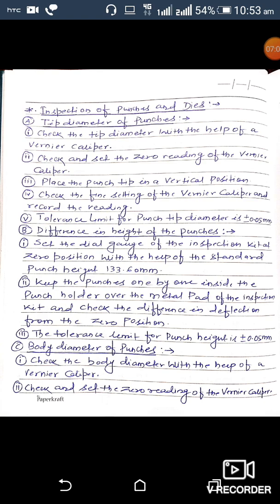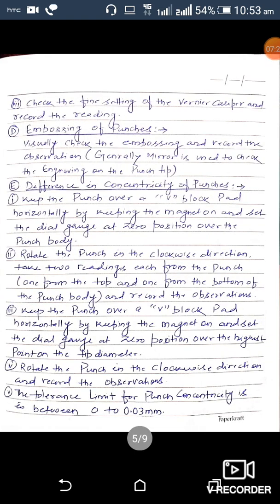Third is inspection of body diameter of the punch: check the body diameter with the help of a vernier caliper, check and set the zero reading, check the fine setting, and record the readings. Fourth is checking embossing of the punch: embossing is generally checked visually. For checking the engraving on the punch tip, a mirror is used.